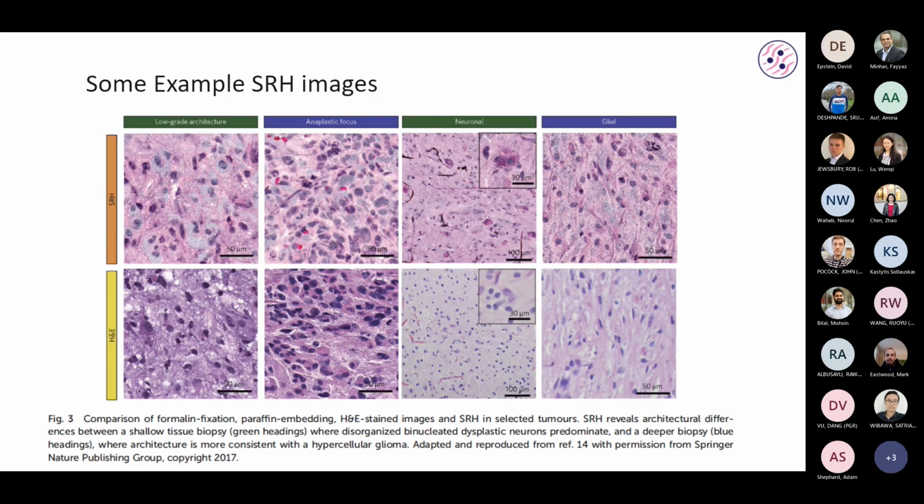Yes, frozen section. If you were doing it in the operating theater, your other alternative is frozen sections, right? Between this and frozen, how much different will the two look for this technique? Well, this is not frozen. So this is imaging live, right?